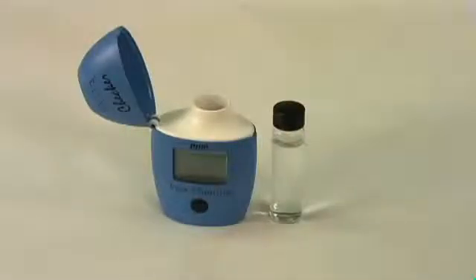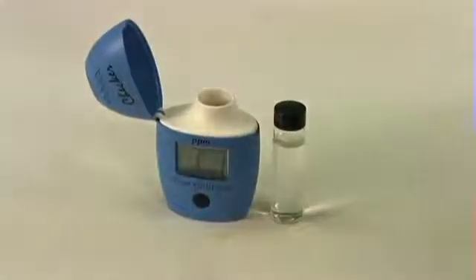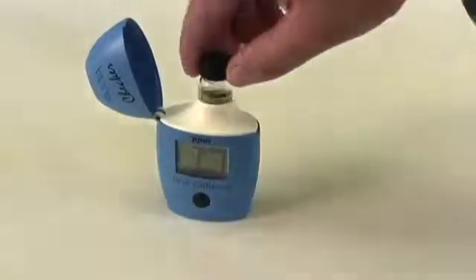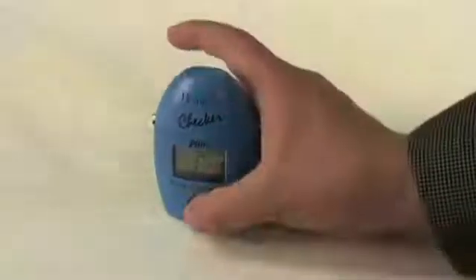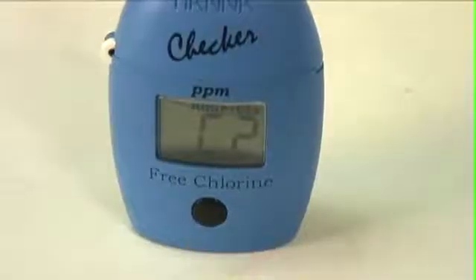So now we're going to fill up the cuvettes at the sink. The first step in our measurement is to zero out the meter, so we're going to first turn it on. Now we're going to clean off the cuvette, index it within the meter itself, and close the lid. Just pressing the button once will actually begin the process of zeroing the meter. And as you can see, now it says C2.